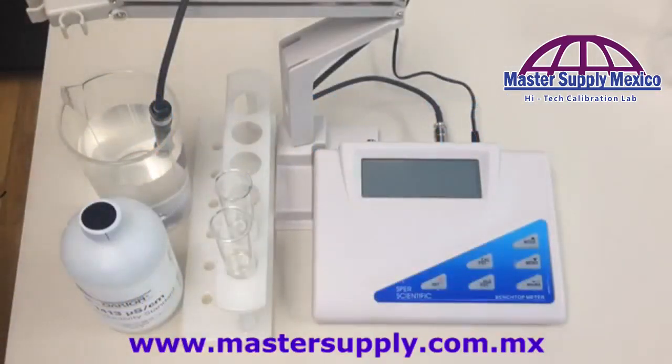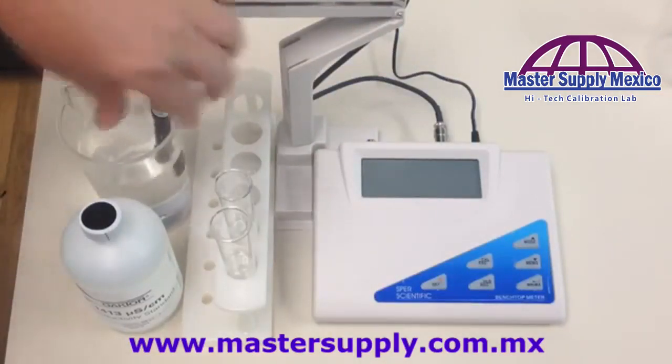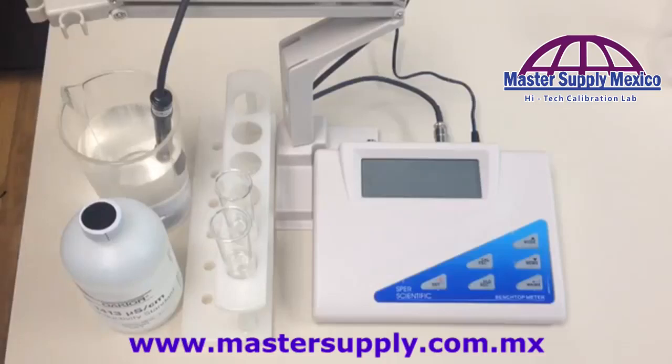Today we are going to be showing you how to calibrate a SPEAR scientific benchtop meter using a conductivity probe. Everything we're going to be talking about is found in your instruction manual beginning on page 31.